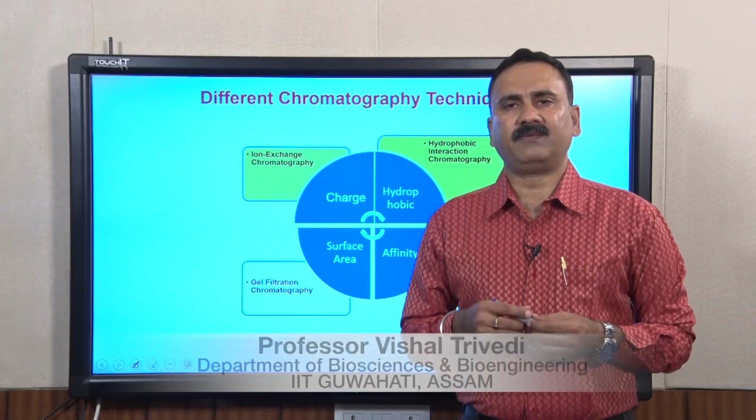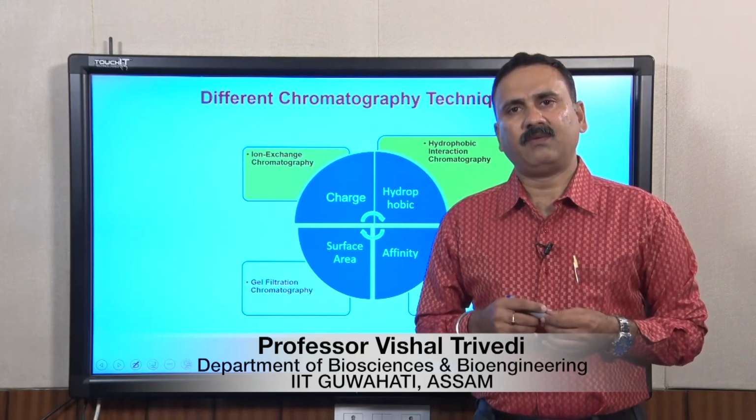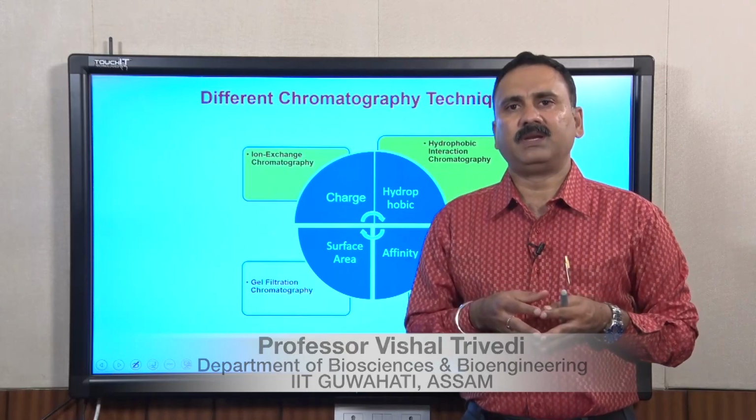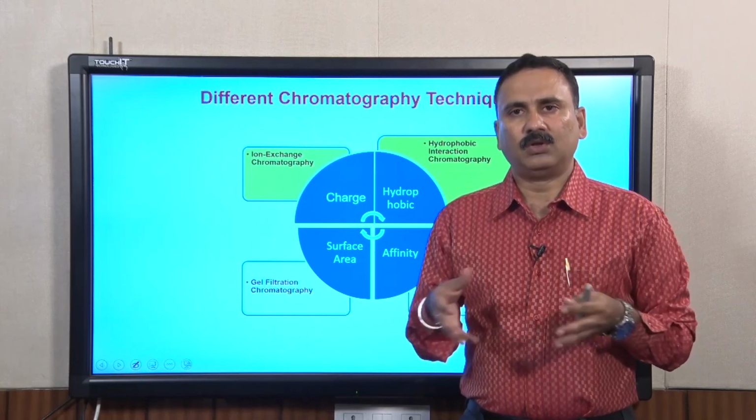Hello everybody, this is Dr. Vishal Trivedi from the Department of Biosciences and Bioengineering, IIT Guwahati, and what we were discussing was the isolation as well as the purification of the overexpressed product from the cells or the host.